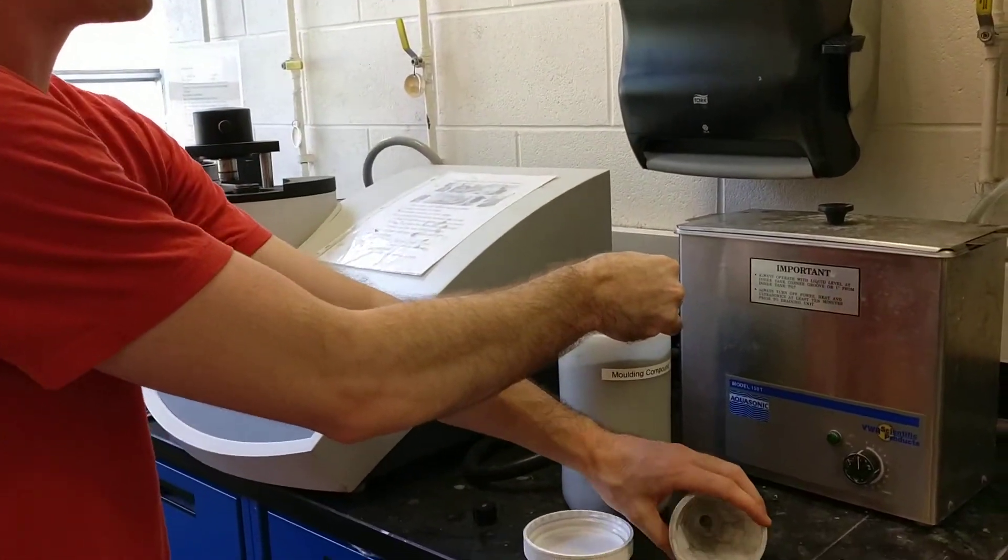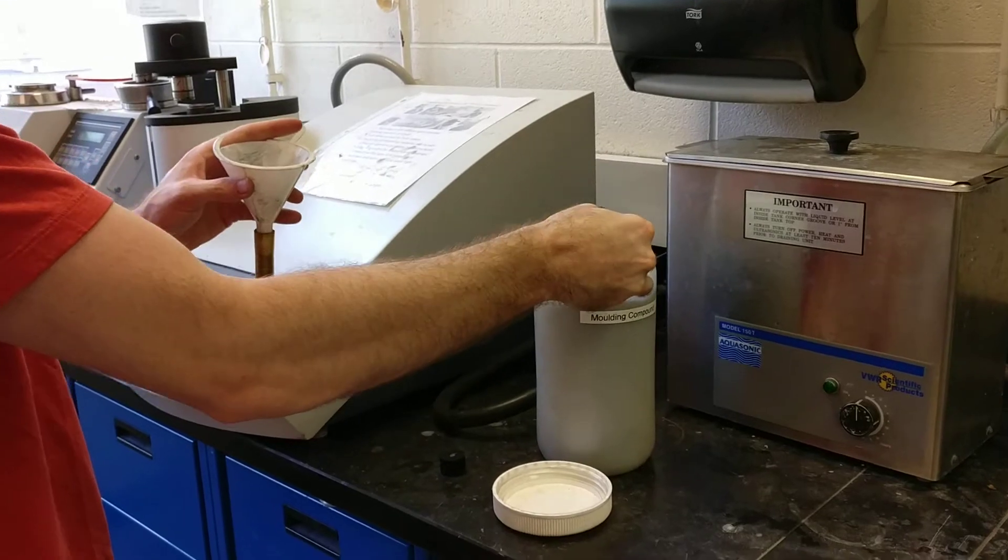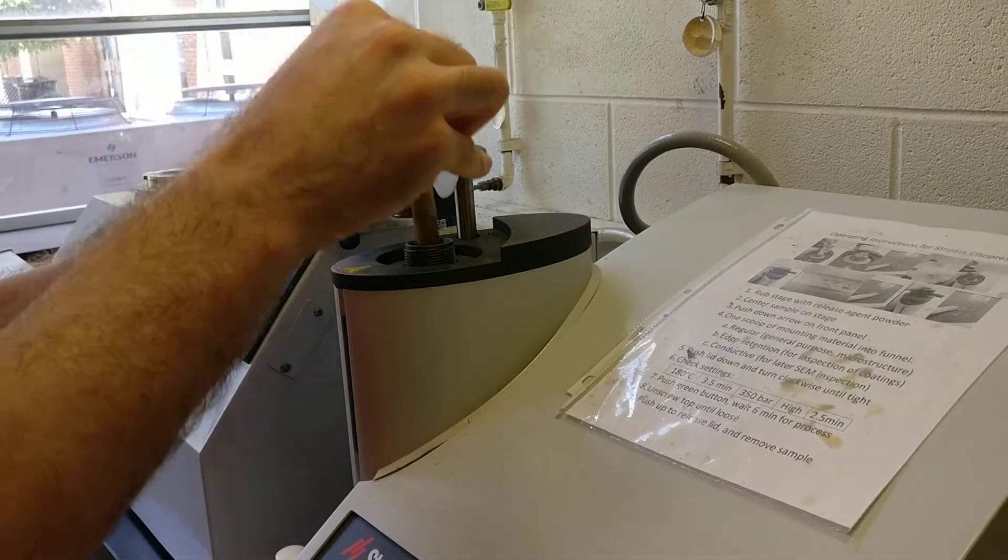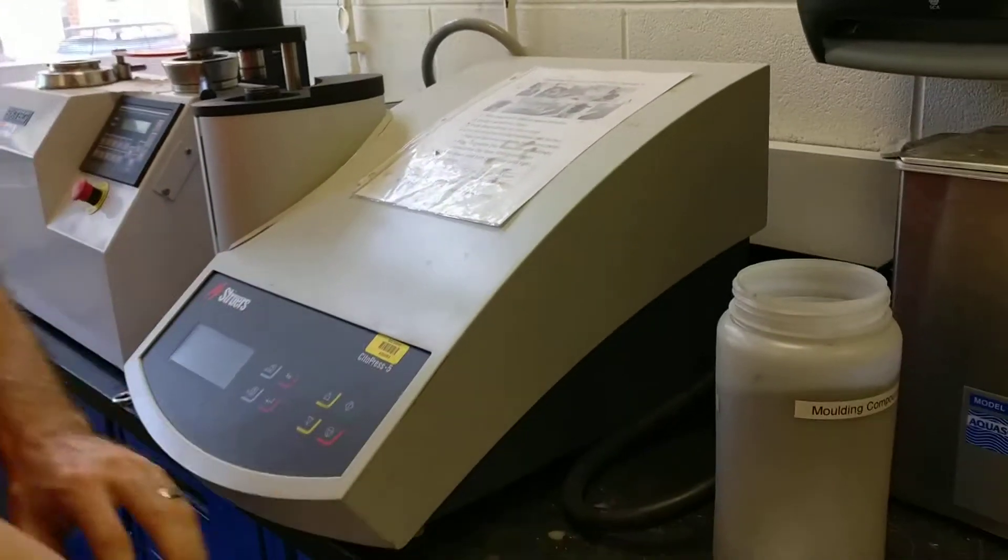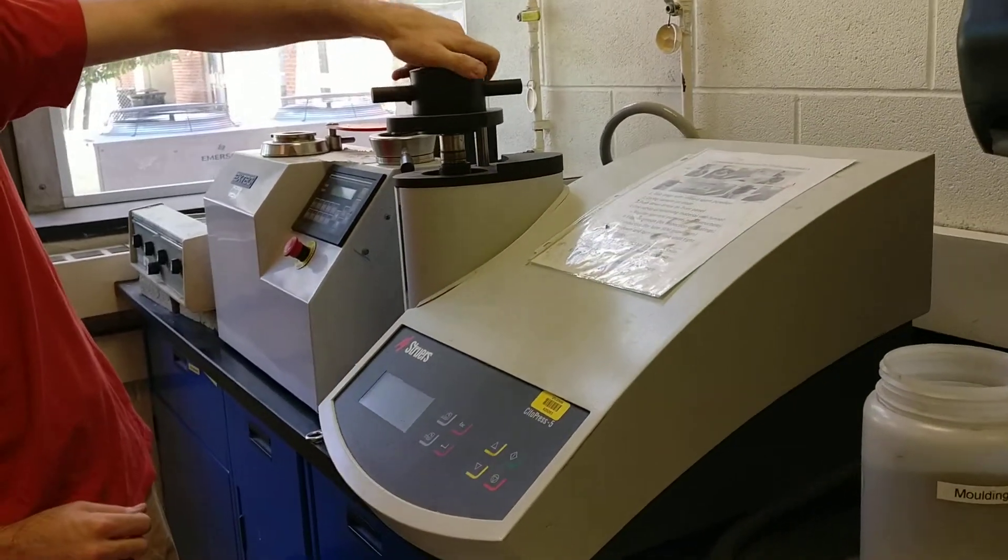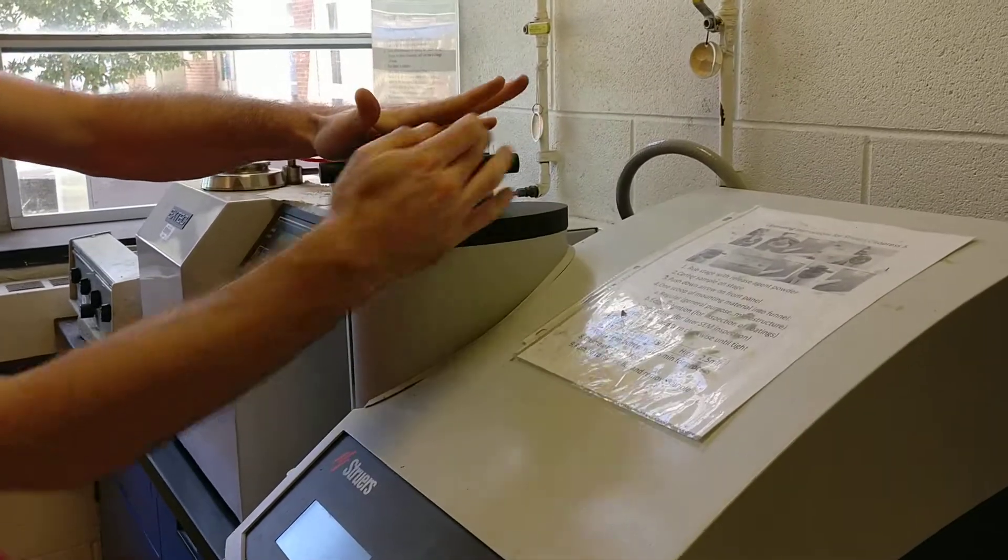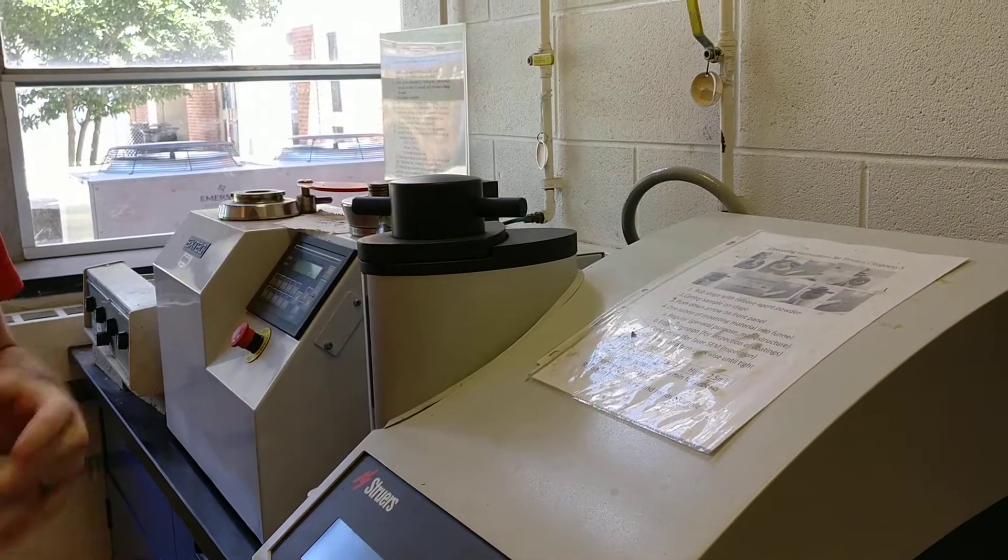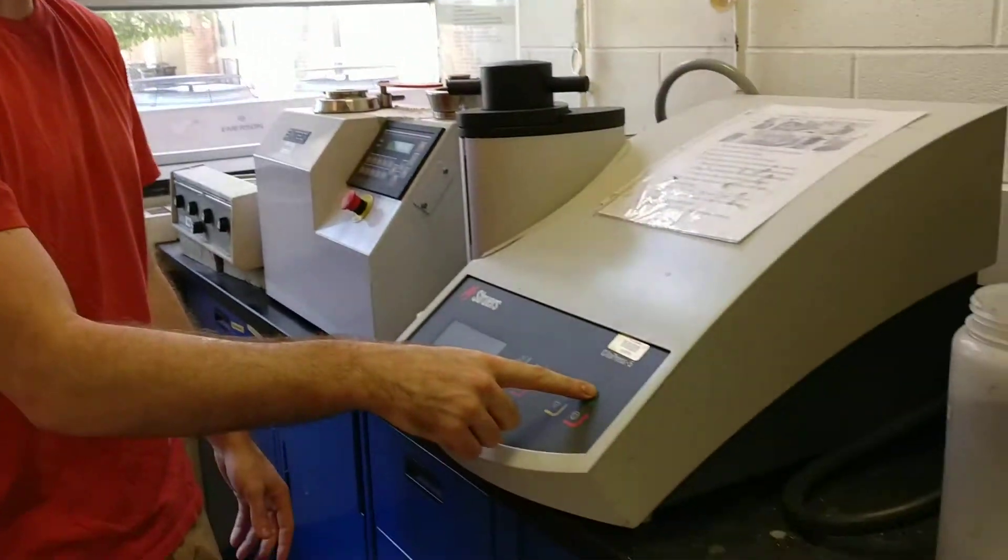You're going to put about one scoop in here, use the funnel to the top. Then you're going to put this in the tub and it just screws closed, so just hand tight. And then all you have to do is press the green button here.